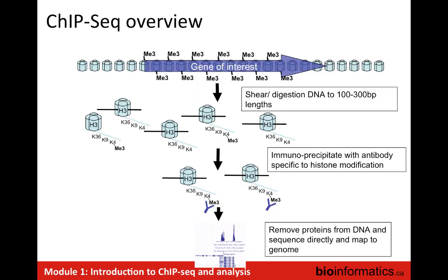Okay, so getting into ChIP-sequencing, hopefully most or all of you are familiar with this. This is a slide I actually made back in, I think, 2007 or 2008, but it's still relevant today. So let's remember that the genome is comprised of these nucleosomes. Of course, they're not in an ordered array like this, although there is some ordering around transcriptional start sites. But we start ChIP-sequencing by shearing the DNA, and this is done in two primary ways, right? We either cross-link the proteins to the DNA, and then we shear them using sonication, keeping in mind that sonication is a single-stranded event, so we clip one or the other, and you have to have two of them together in close proximity, and that has implications as you get into the analysis.